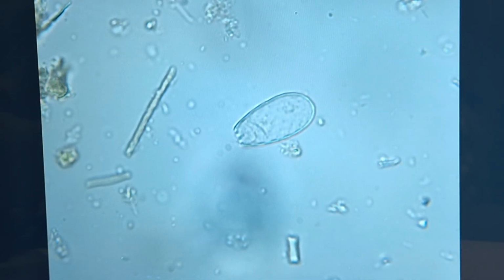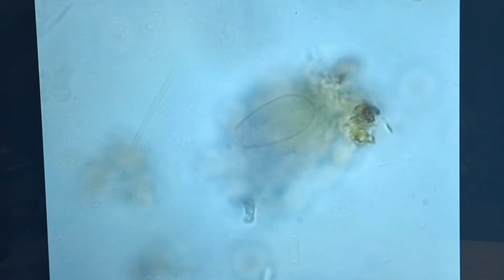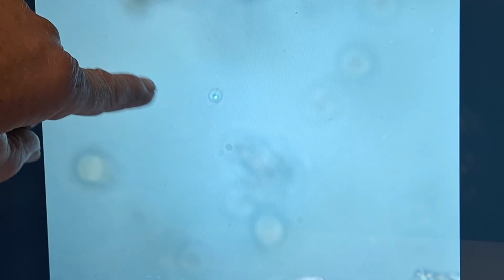So now we've seen those. We'll look for their flagellate as well while we're here. Here's a flagellate. Oh, swimming away. It can be hard to see. They're in a different layer sometimes, so we zoom in and out. We'll see the tail behind it moving, the single flagellum behind it, and it's whipping that around. That's making it move. So that's a flagellate.